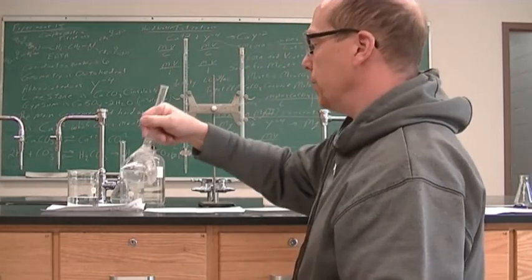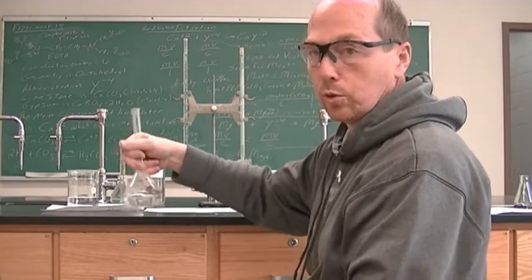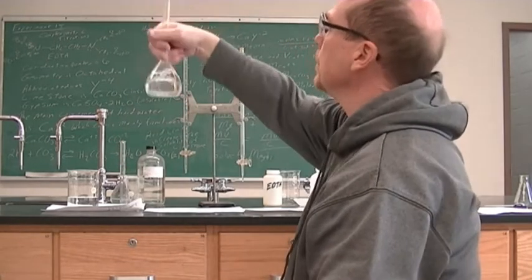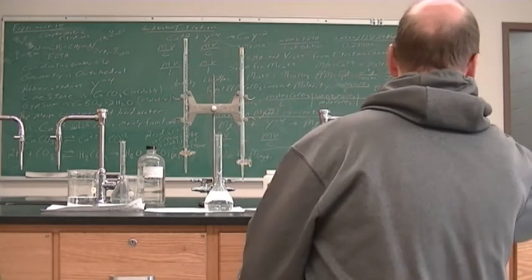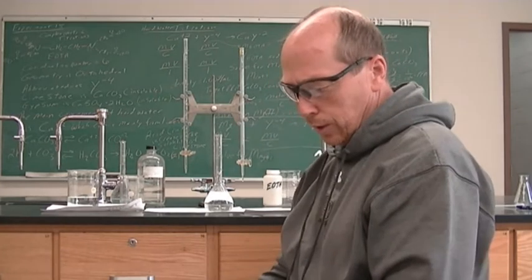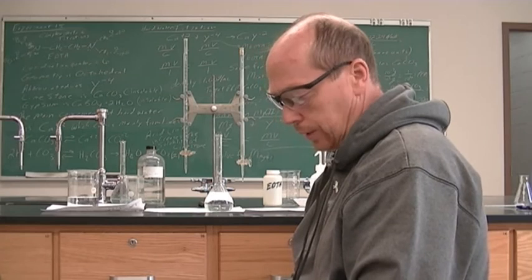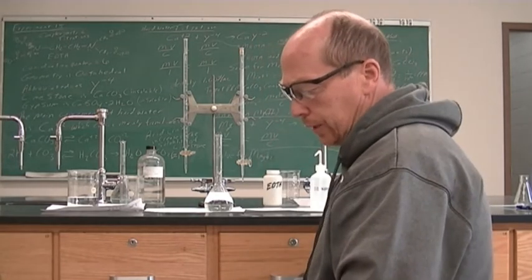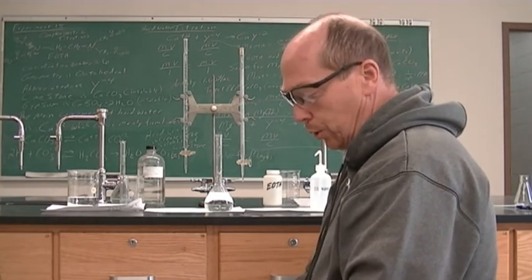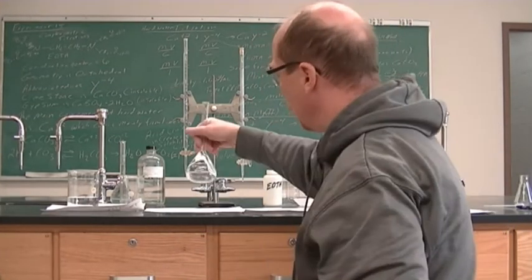All right, still dissolving my EDTA. It's getting there. Each time I swirl, more and more dissolves. All right, very close. So I'm going to prepare for the titration. I weighed out the 1 gram. We now know what it is to 4 decimal places, and then I am dissolving it. So we have our water sample. It's just from the tap right behind me here. It says the pipette. We are going to do the burette. And so we will get ready for our titration while our EDTA is still dissolving.